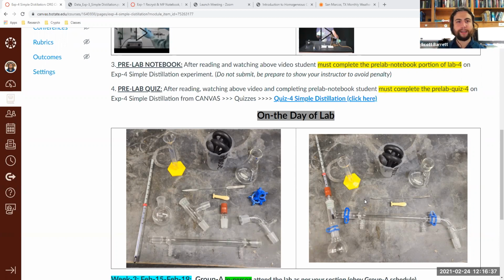And if you heat something and it doesn't have grease in between the glass rings where they hold into each other, then it can actually expand and it could possibly crack or just seal onto it and get stuck. Then once you're done with the experiment, you can't remove it very easily. So we always recommend adding grease onto these little sections. We utilize the clamps to hold them together.